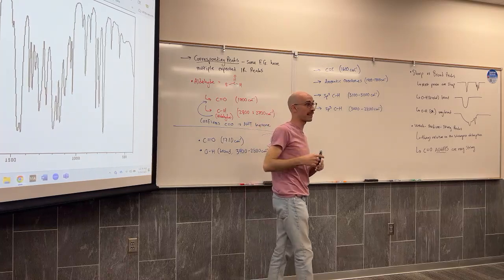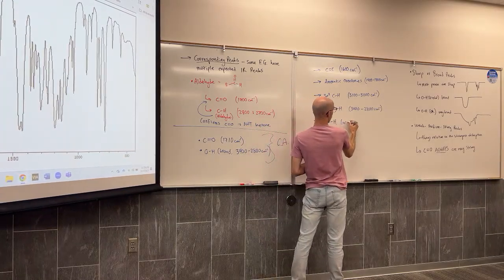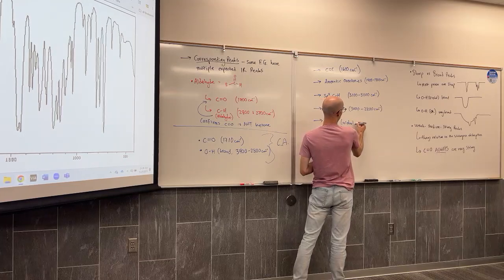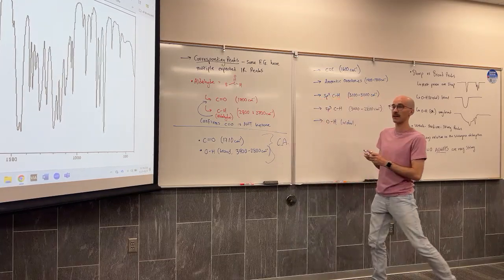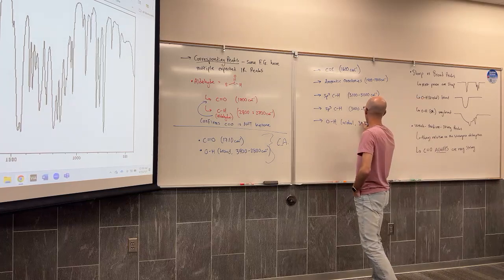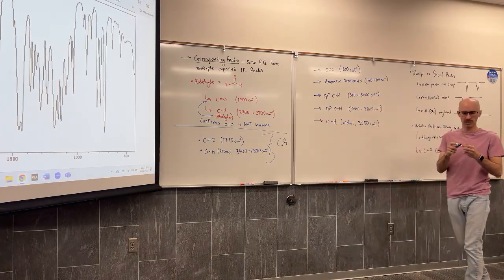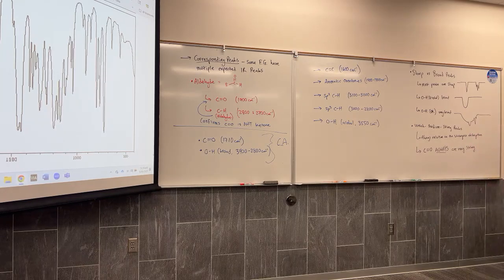So I don't think that's NH up top. I think that's OH, specifically of an alcohol, and it is in a high range. It looks like it's around 3550 wave numbers. That's higher than what our correlation table tells us to expect.